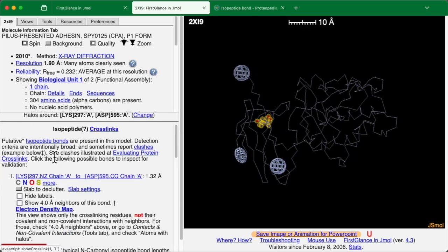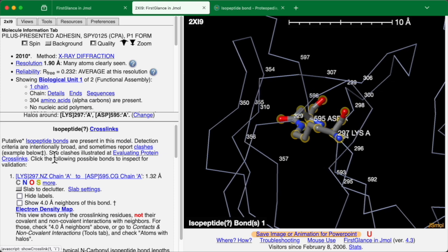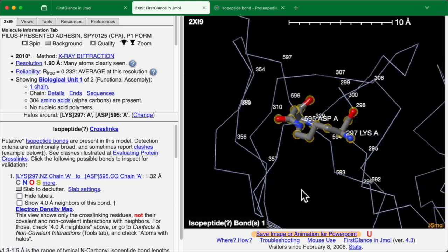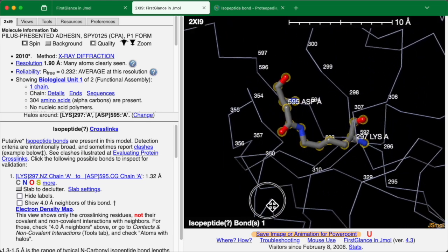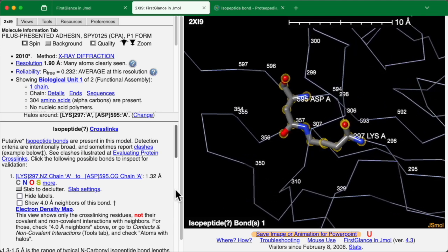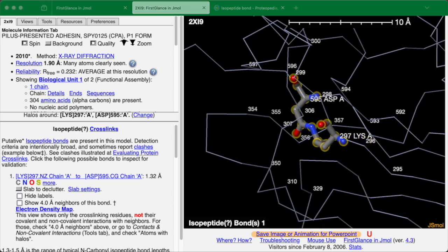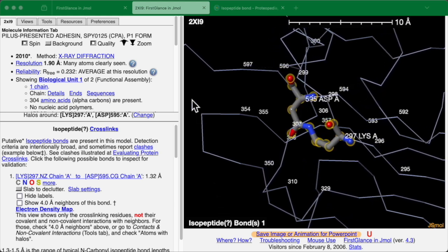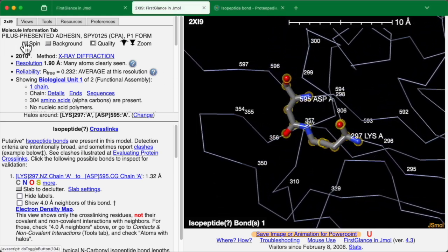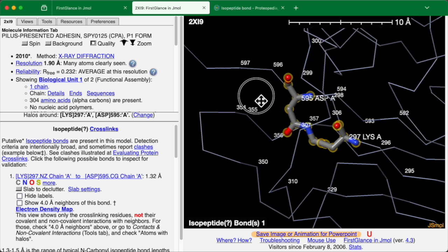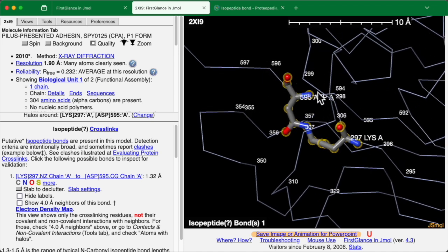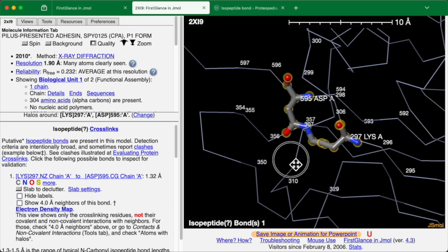A little movie plays showing you where the putative isopeptide bond is in the structure and zooming in and allowing you to examine it in atomic detail. I'll turn off spinning and these thin blue lines are backbone traces. And we see that along this backbone trace, we have aspartic acid 595. Here are the main chain atoms. Here's the side chain.